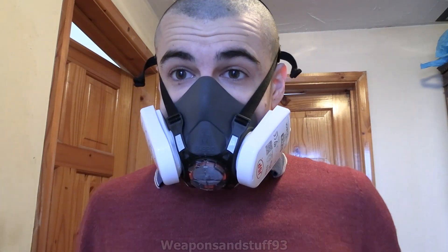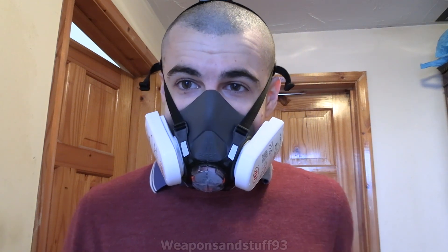Now the JSP Force 8. This is one of the ones with a neck clip. Basically what you do is first put this around here then clip it. It's the same as the Ellipse where it will just hang from your neck. Again you've got adjustable top straps, but the process is very similar — once you've got them tightened to how you want them you just pull it up and the mask is in place. Obviously make sure you've got the filters on if the mask was issued with filters, because if you haven't got the filters on it won't do any good.